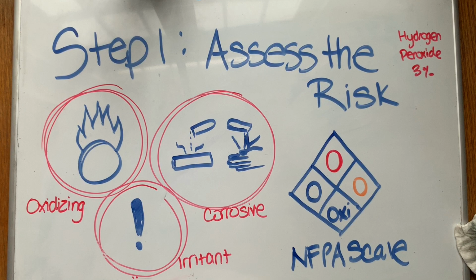In the first step, it is important to address the level of protection, like respiratory protection, and this step begins in the moment the spill occurs. And it is important to recognize the potential dangers and act immediately. The important questions that you should ask in order to assess the risk are: what substance is involved? In this case, it's hydrogen peroxide, 3%. How much liquid is spilled?